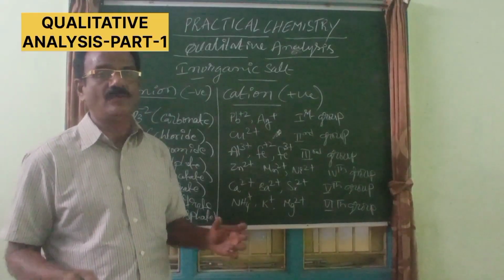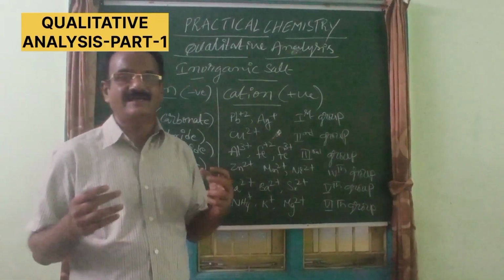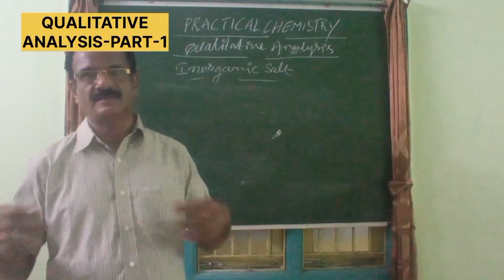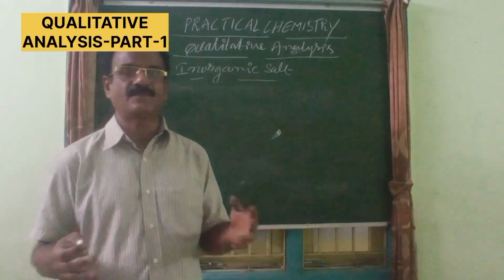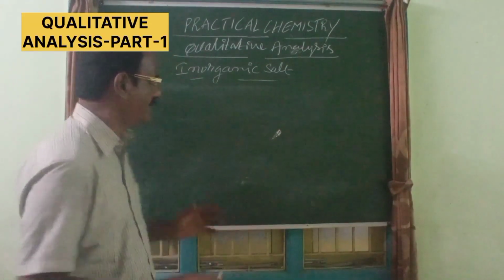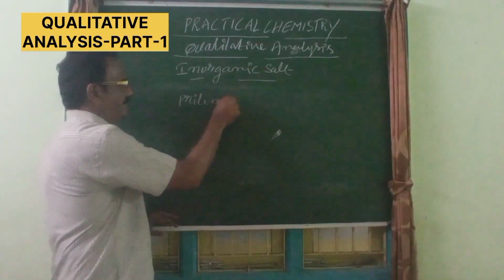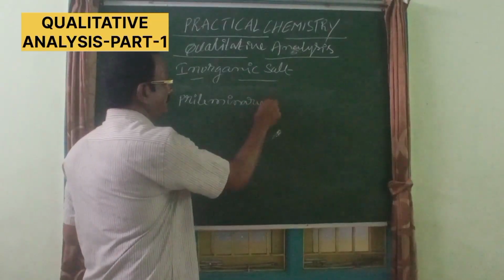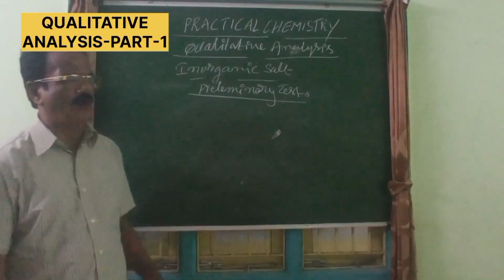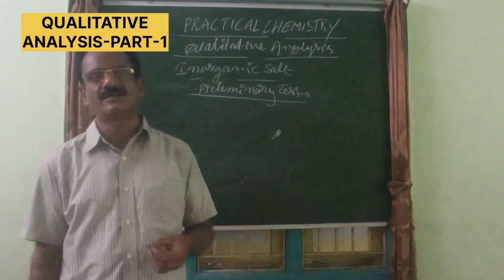Let us see how you have to identify the ions present in the inorganic salt. The procedure can be divided, for the convenience of the analyst, into the following parts. The procedure incorporates preliminary tests. See what information one can get by doing preliminary tests regarding inorganic salt.